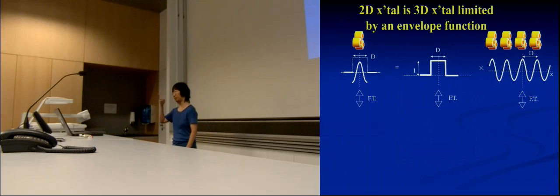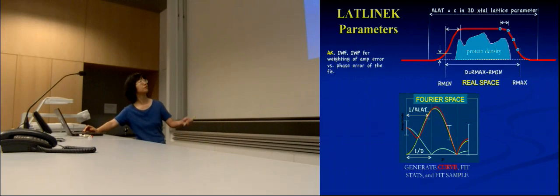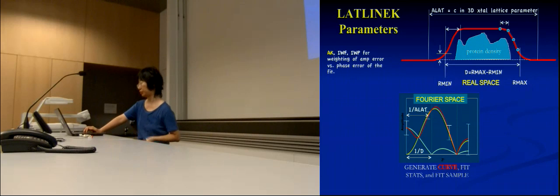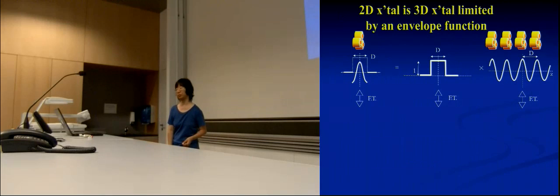So that's really, let me see, 3 values that you need to take care of. One here, let's see, if you have a 0, then you have a minimum, you have a maximum, that gives you the distance for your envelope. And then you need this value for defining how you sample. So 3 values you really need to think about. But they are really important values.